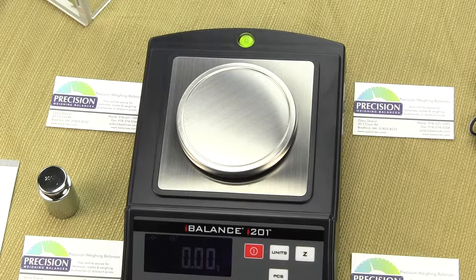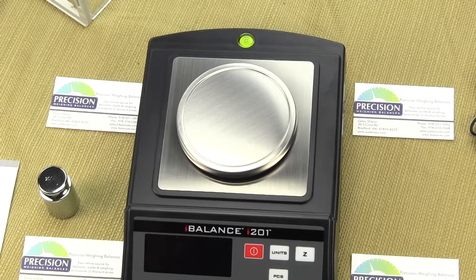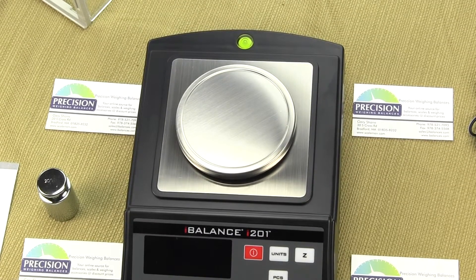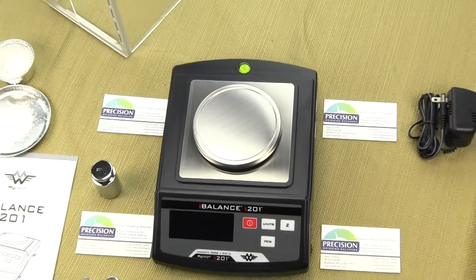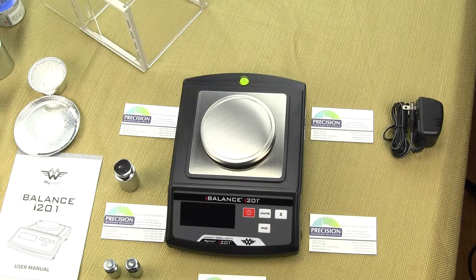Now let's go over the keys on this scale. We have the red button — this is the on and off. When you power up the scale it goes through the power-up sequence. We have the units key for changing the unit of weight and also for putting the scale in parts counting mode. We also have the Z key, which is the tare function to tare the weight of a container. And then we have the PCS key for parts counting.